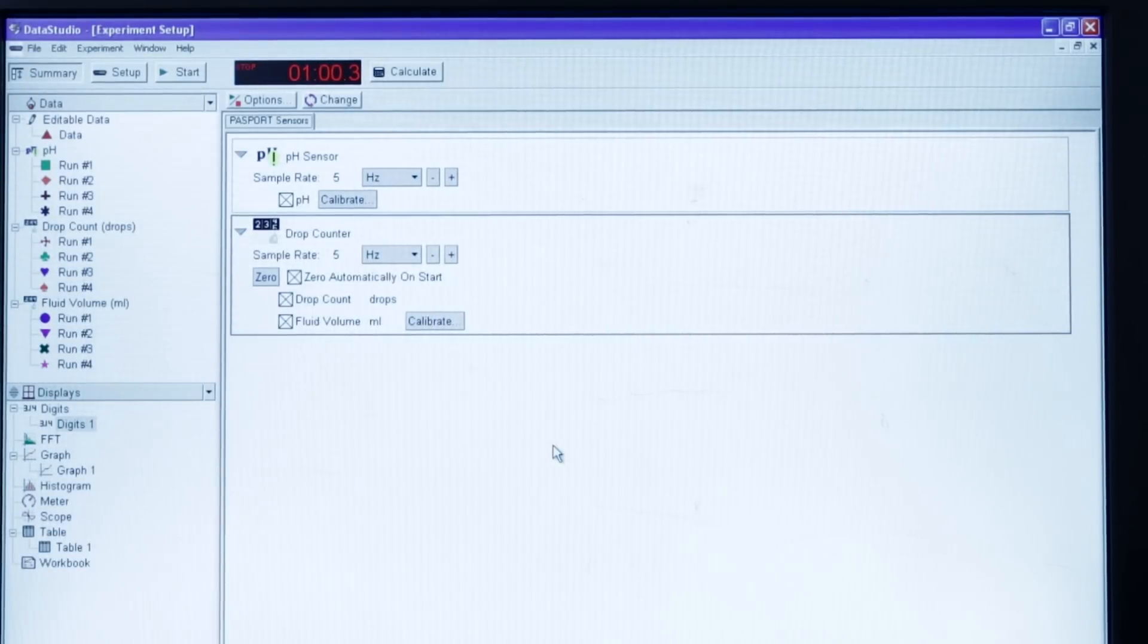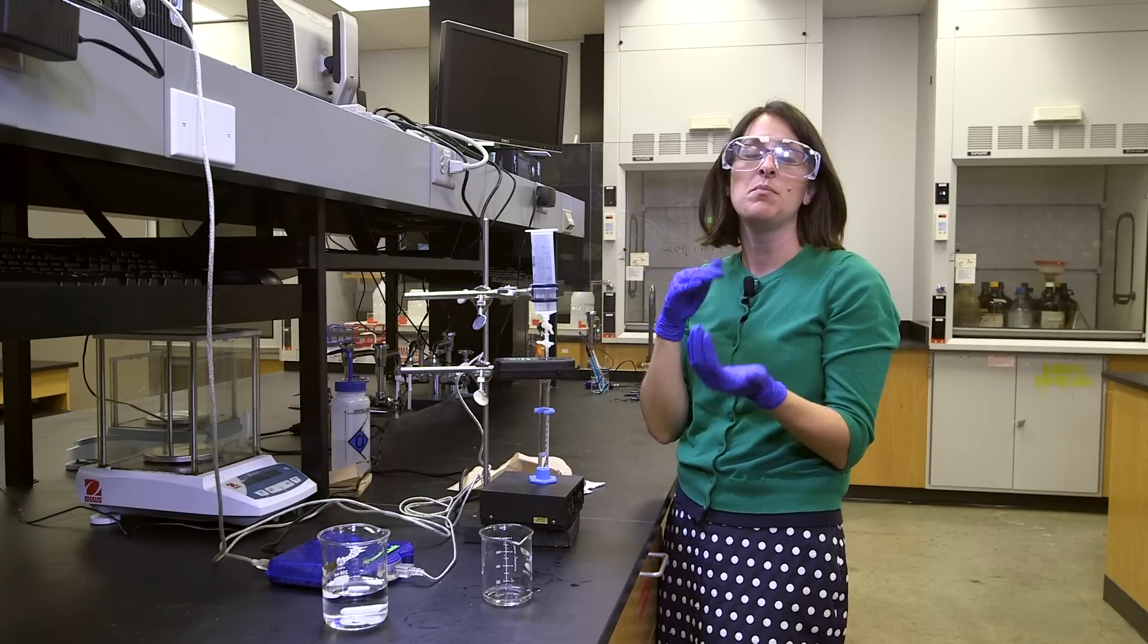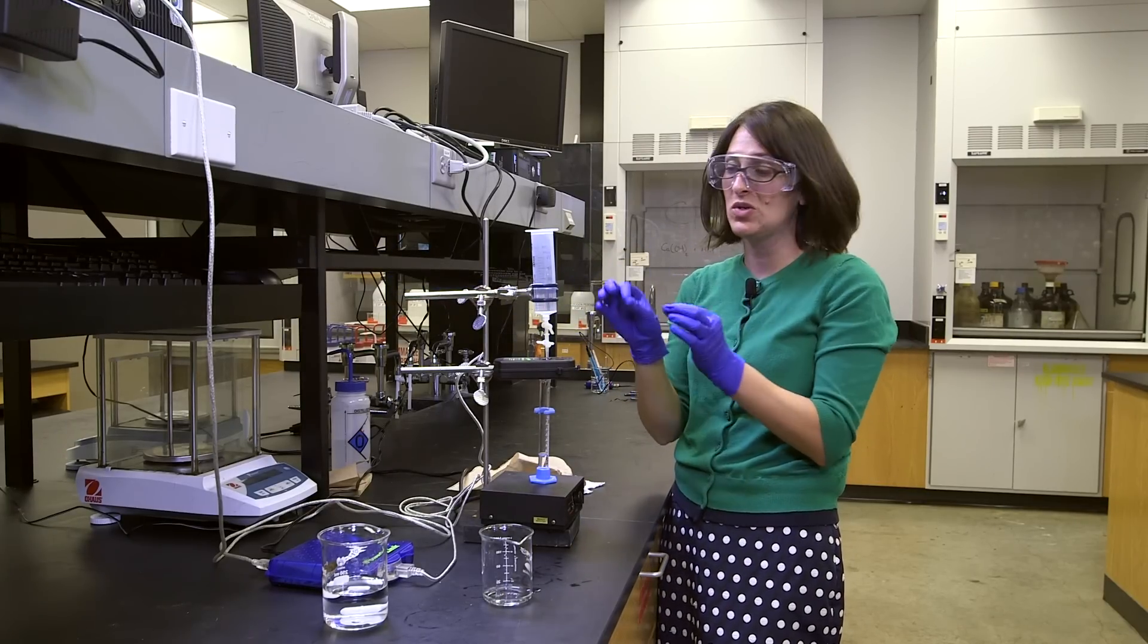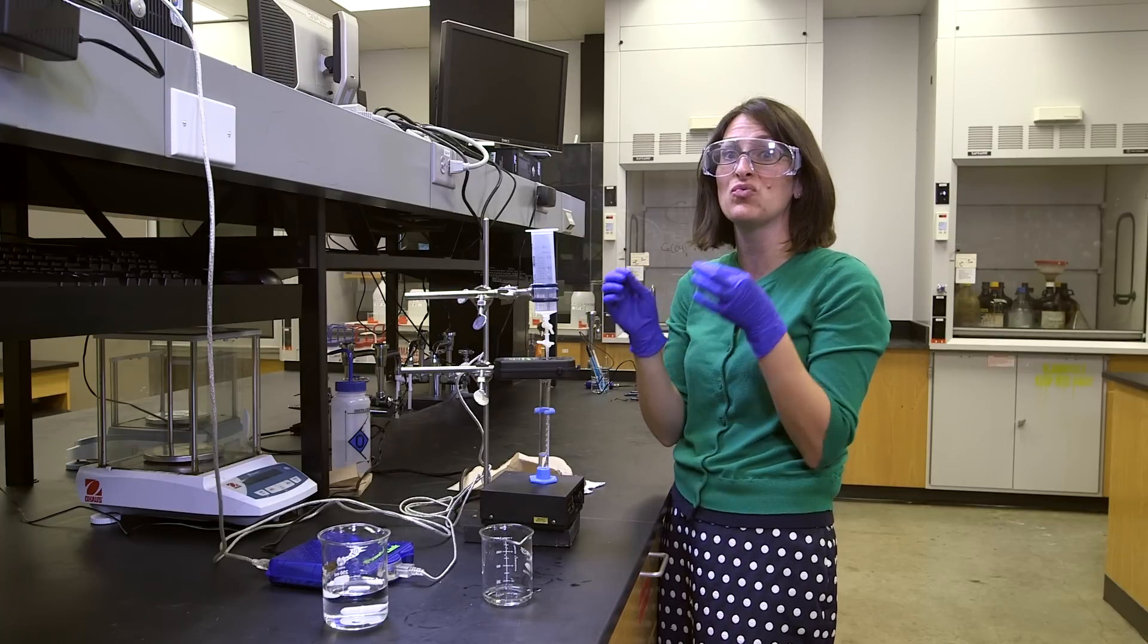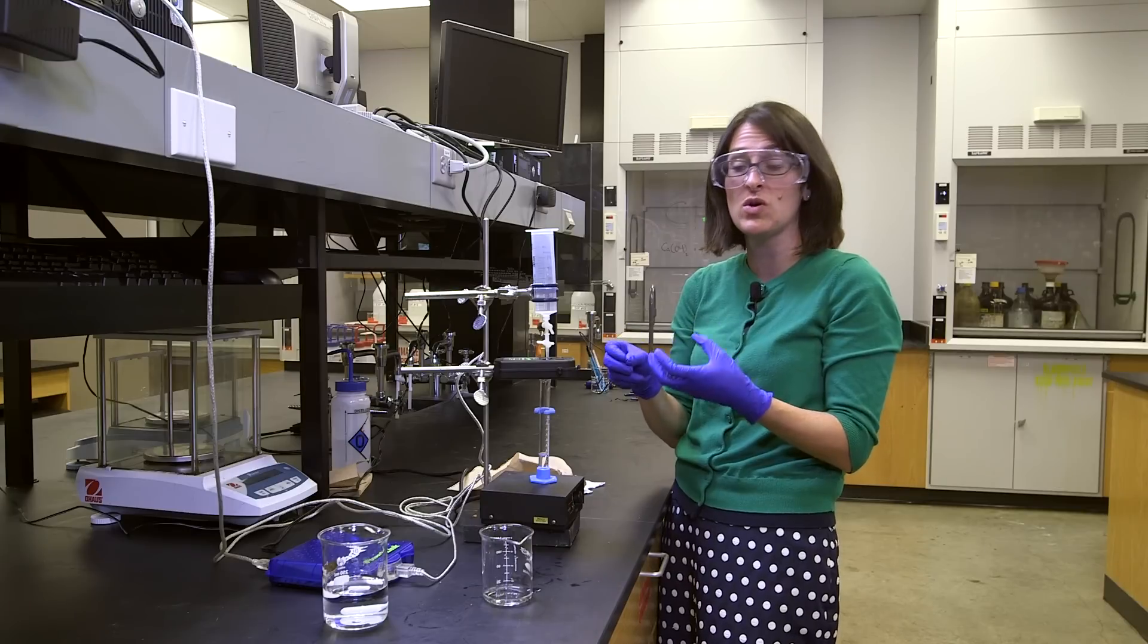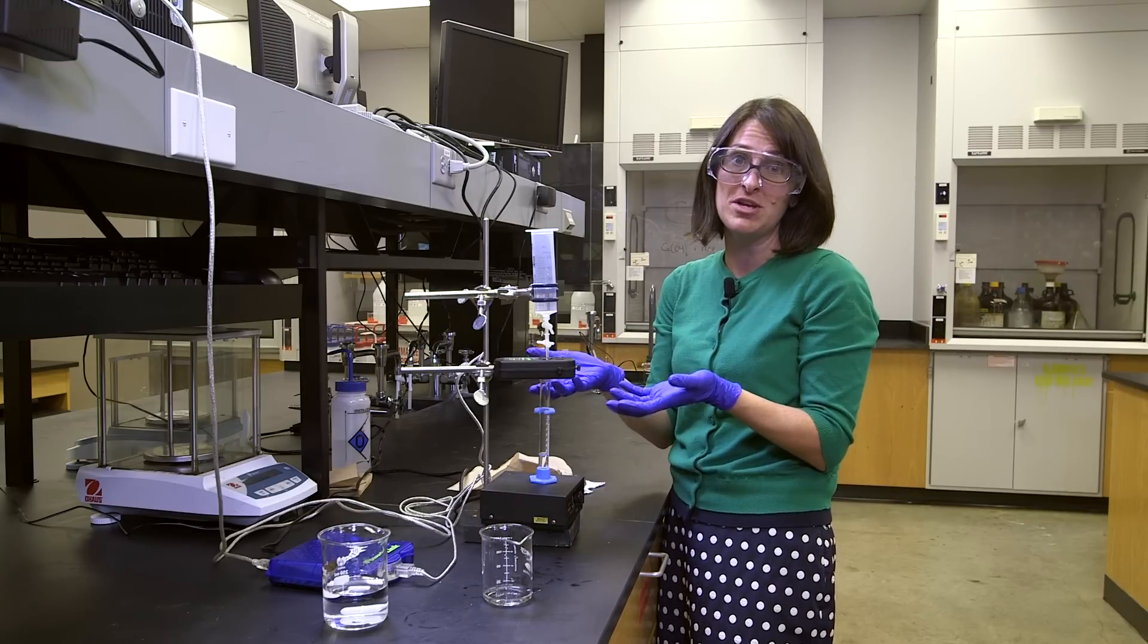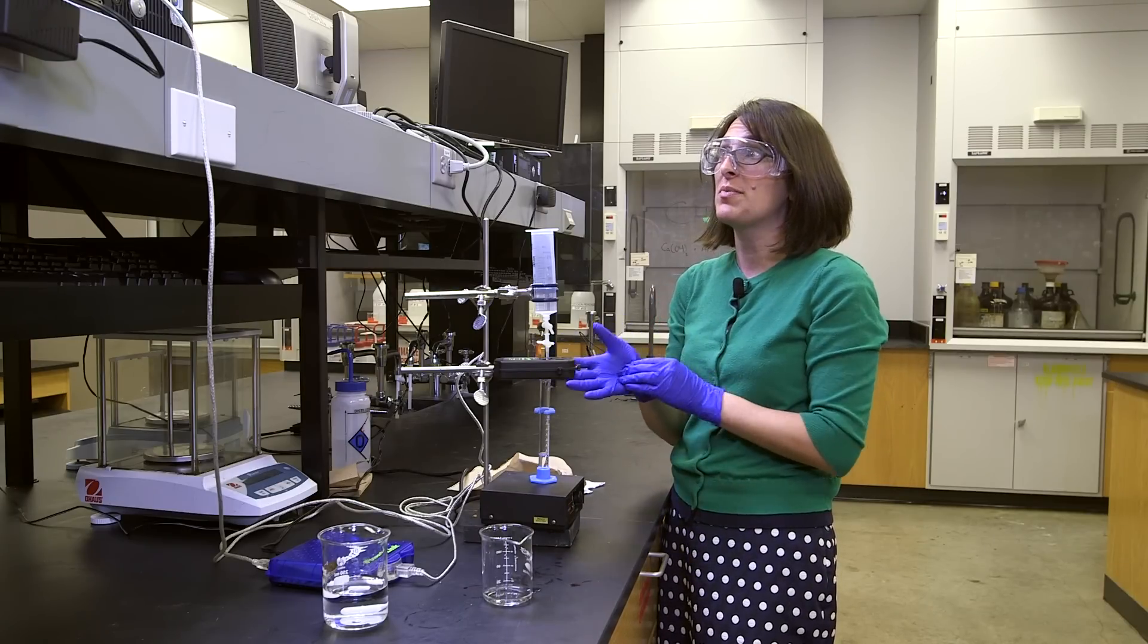Click okay. And then it's going to be able to divide the number of drops by the total volume. So it's actually calculated what the volume is for each drop, which is really convenient. So it's not something you have to record, the instrument does it for you. So that's how to use a drop counter.